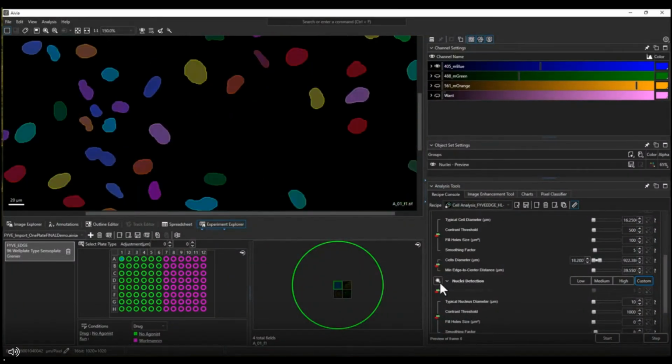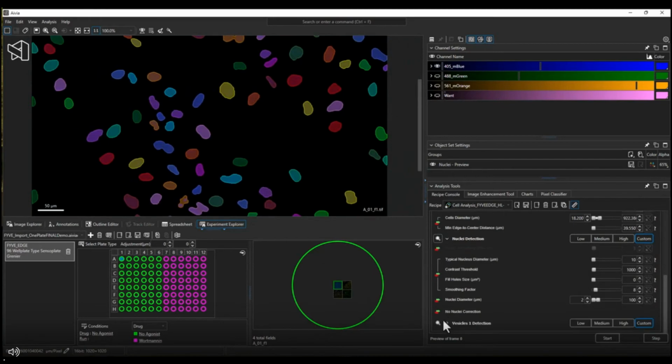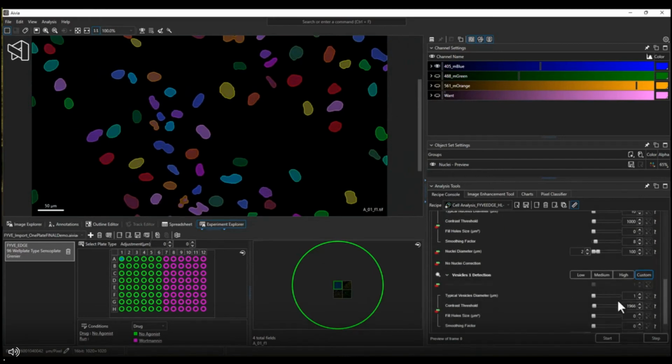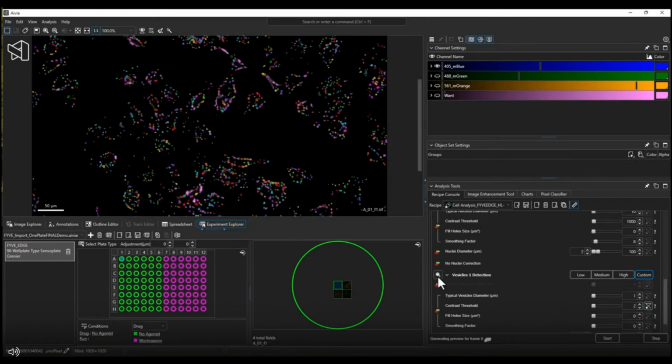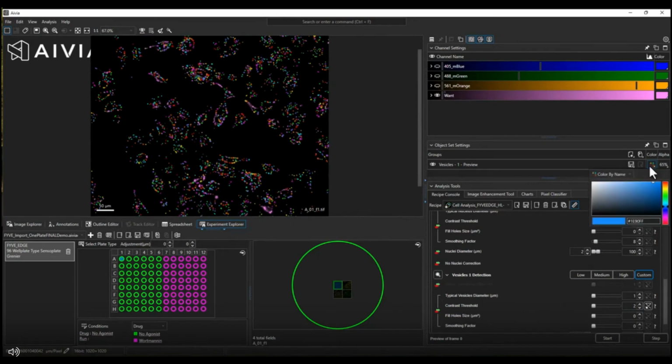Looking pretty good there. Then I move on to the last vesicle detection step. This is the step where I fed the pixel classification step to feed in the channel, and you can see in this example that those vesicles are actually separated into different discrete objects. So you could do per object analysis and you can get per object measurements.